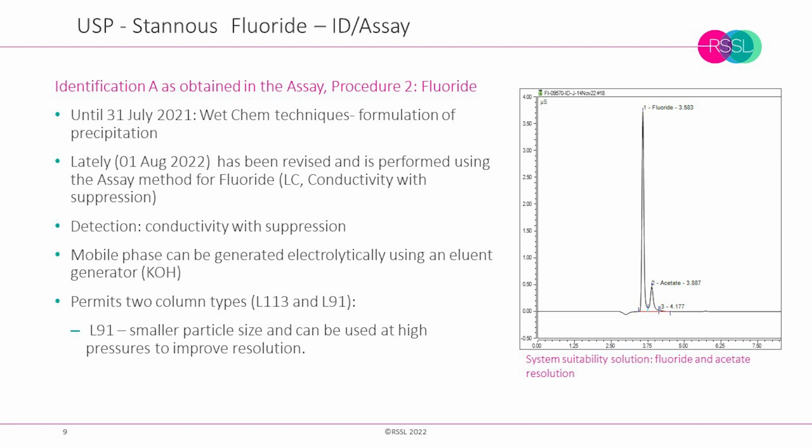RSSL. Today I'm going to take you through some examples of ion chromatography applications from pharmacopeial monographs and illustrate how and why they can form the basis for development of new analytical methods.